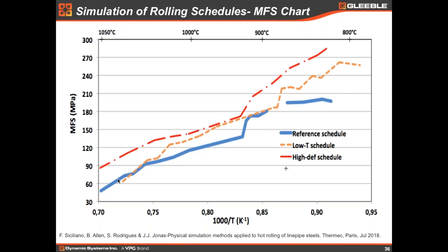It says, is it possible to focus on refining the subgrain structure as opposed to grain refinement? It may be a fairly general question. Right. Yeah, the subgrain structure is more influenced by recovery. So the recovery will have a strong consequence on the subgrain structure. Of course, if you refine the subgrain structure, this means that if you apply more strain, you refine the subgrain structure at cold deformations. But we're talking about hot deformation.